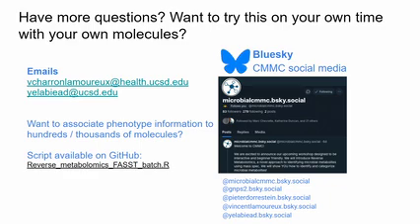So we have this script that we also uploaded on GitHub, and it's available to you right now. This one will allow you to create the same heat map or the same workflow that you have, but with tens, hundreds, and thousands of molecules. The only thing you need is a Google sheet with the USI and the compound name, and that's it. Then you can go to a specific GNPS workflow called the batch fast workflow. It's also available on GNPS. You can add it to the documentation, but know that the script exists and there's information embedded in the script that tells you how to proceed. Know that it's possible to achieve what you just did today with tens to hundreds to thousands of molecules.